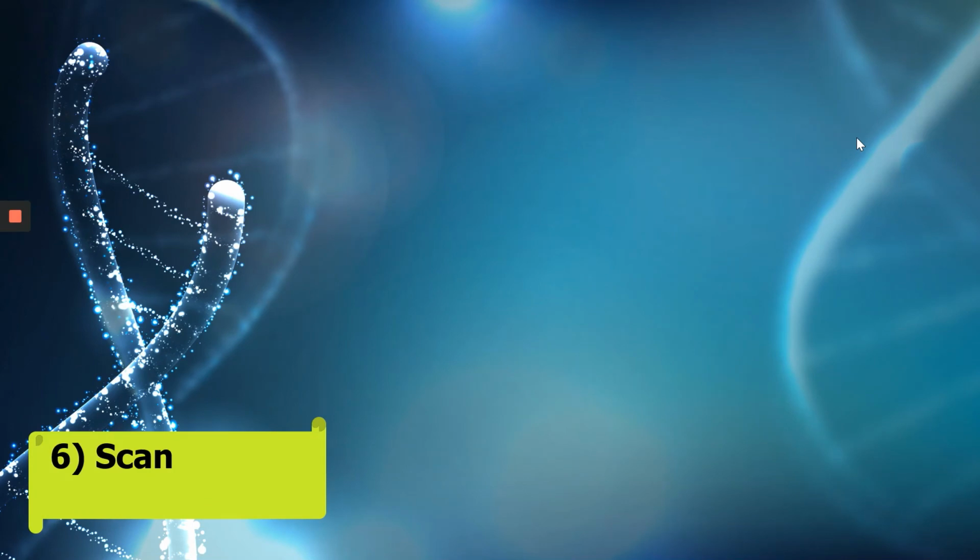Okay, so after that is a process called scanning. For scanning, we will scan it using two lasers, the red laser and the green laser. It will be done one by one. After the scanning of one laser, the data will be kept in the computer for further analysis.